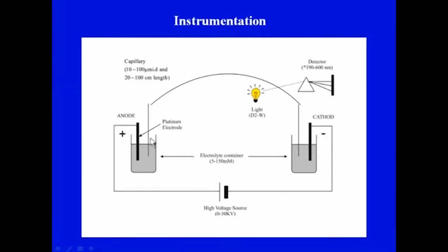The source vial and destination vial which I have shown you, the anodic one and the destination vial, are filled, and the capillary also is filled with an electrolyte, which is an aqueous buffer solution. Now, to introduce the sample at the capillary inlet, what will be done is that the anodic buffer chamber could be removed and the sample-containing device put in.